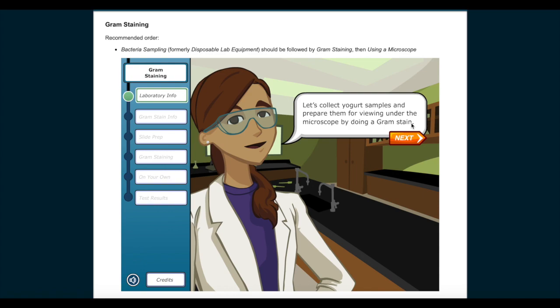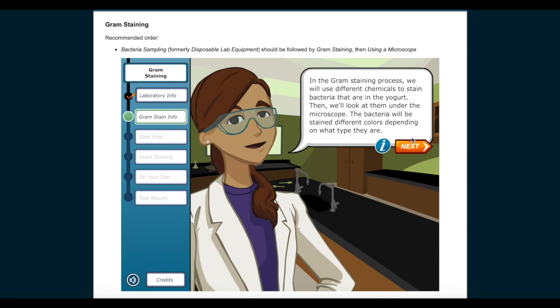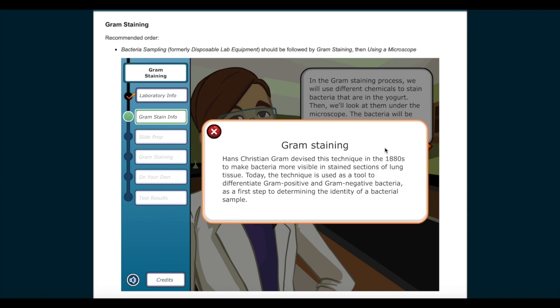Let's collect yogurt samples and prepare them for viewing under the microscope by doing a Gram stain. In the Gram staining process, we will use different chemicals to stain bacteria that are in the yogurt. Then we will look at them under the microscope. The bacteria will be stained different colors depending on what type they are. Gram staining. Hans Christian Gram devised this technique in the 1880s to make bacteria more visible in stained sections of lung tissue. Today, the technique is used as a tool to differentiate Gram positive and Gram negative bacteria as a first step to determining the identity of a bacterial sample.